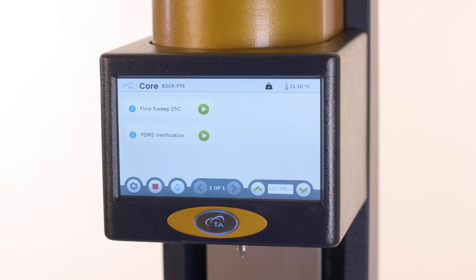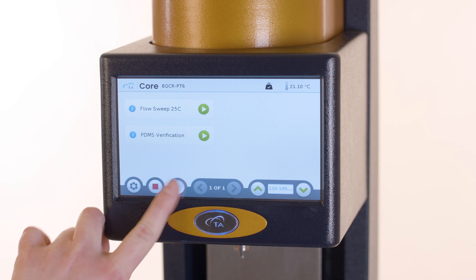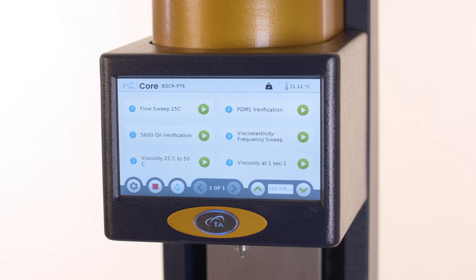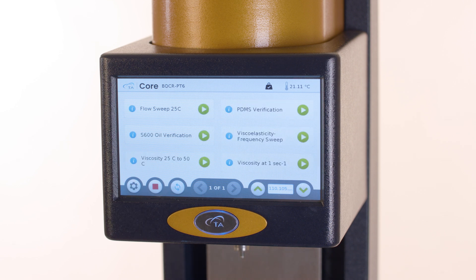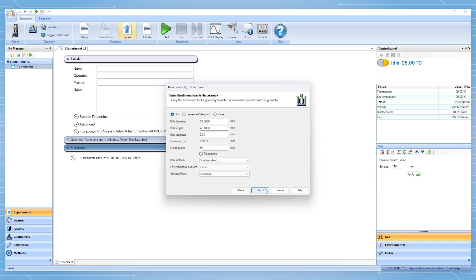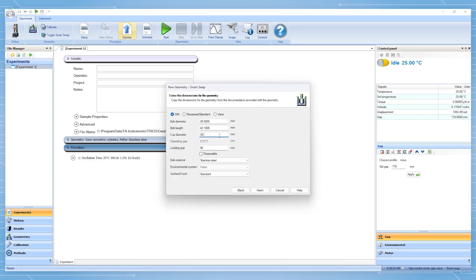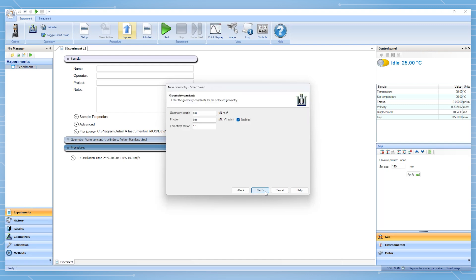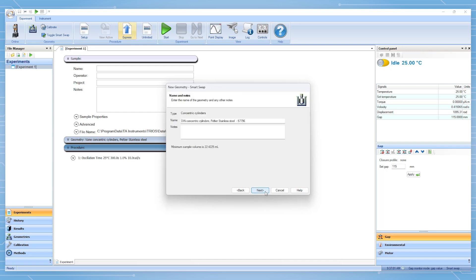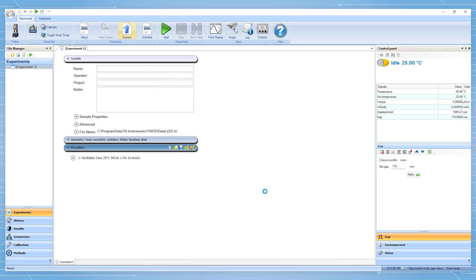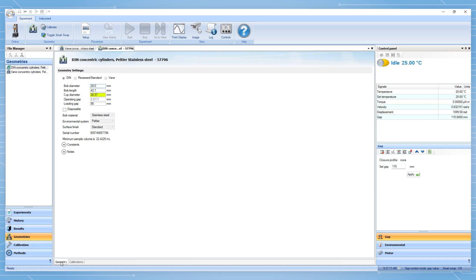The touchscreen now shows the RayoGuide home screen with available methods. You may refresh the methods by selecting the refresh icon. Please note that an approximate value is used for the cup diameter when a new concentric cylinder geometry file is created. We recommend adding the concentric cylinder in classic mode so that the diameter may be updated with the value inscribed on the cup. This update only needs to be performed once per cup.